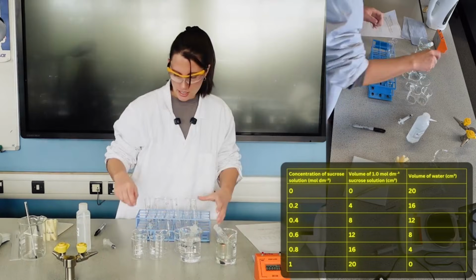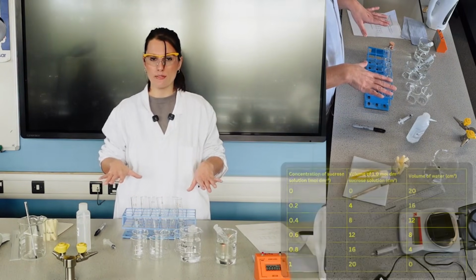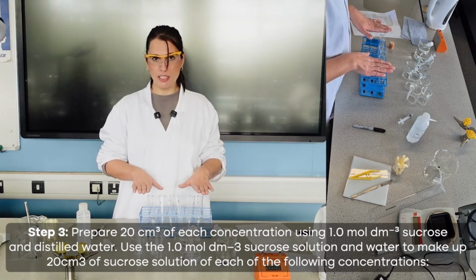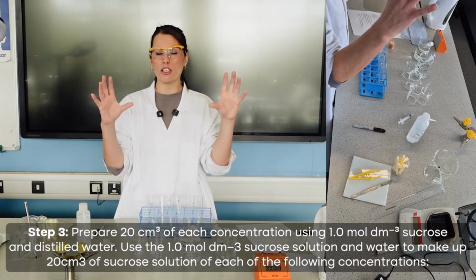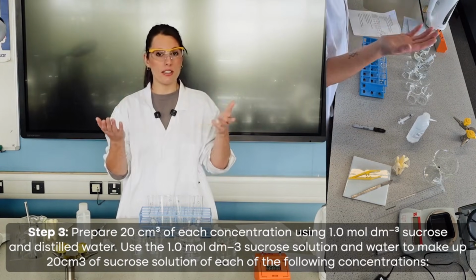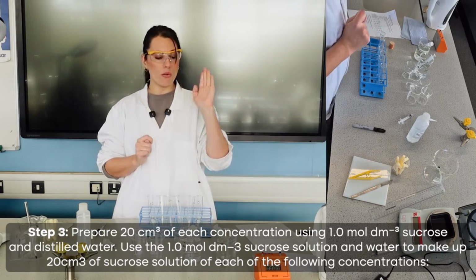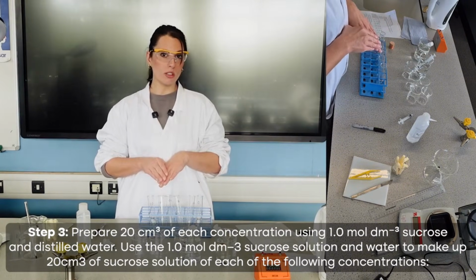Okay, so that's those two made. The rest now, we are going to need to create these different concentrations. All of these need to have the same volume in, and we're having 20 centimeters cubed. So the students could either do a dilution series, or like the table that I showed, they could work out using the serial dilution calculation what volume of the 1 molar sucrose solution they need to add and what volume of the distilled water they need to add.